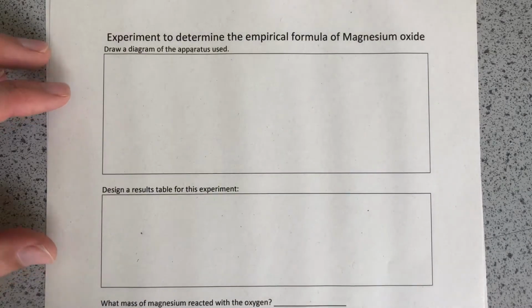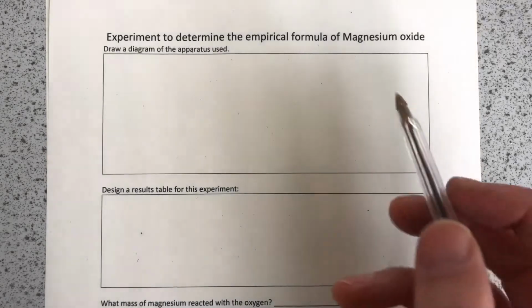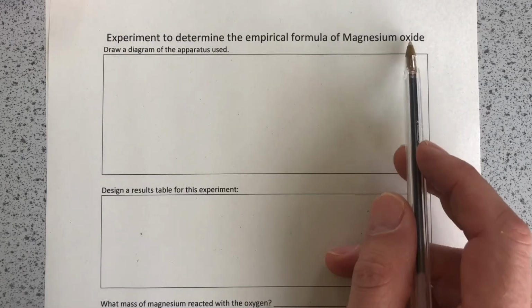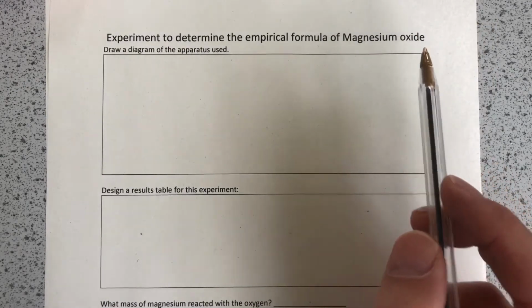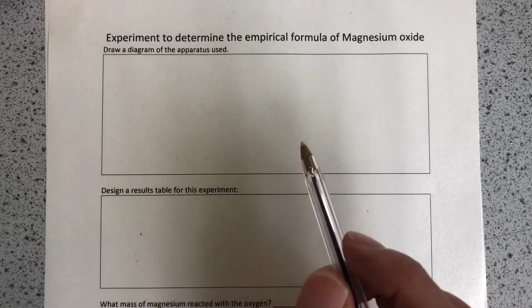So far we've done lots of empirical formulae calculations, but what we're going to look at here is actually how we can collect the data from an experiment to work out the empirical formulae. So what we're going to try and do is work out the empirical formula of magnesium oxide. Now this is not a core practical, but in the specification it does name this, and it is tested almost as much as the core practical work.